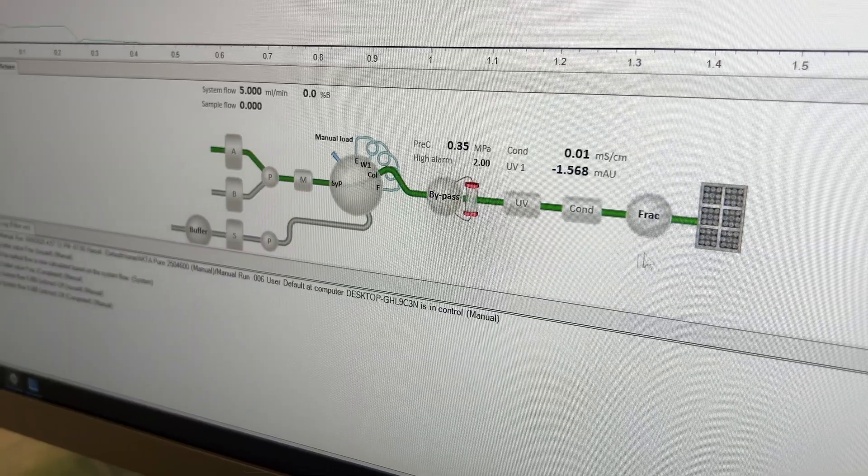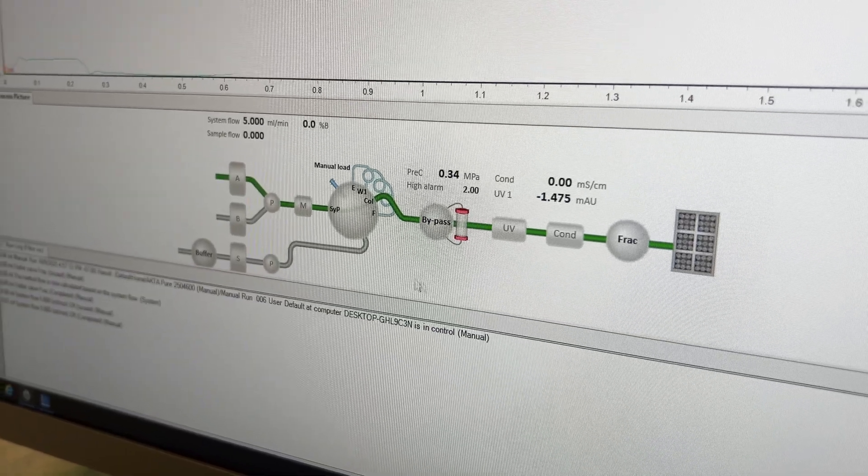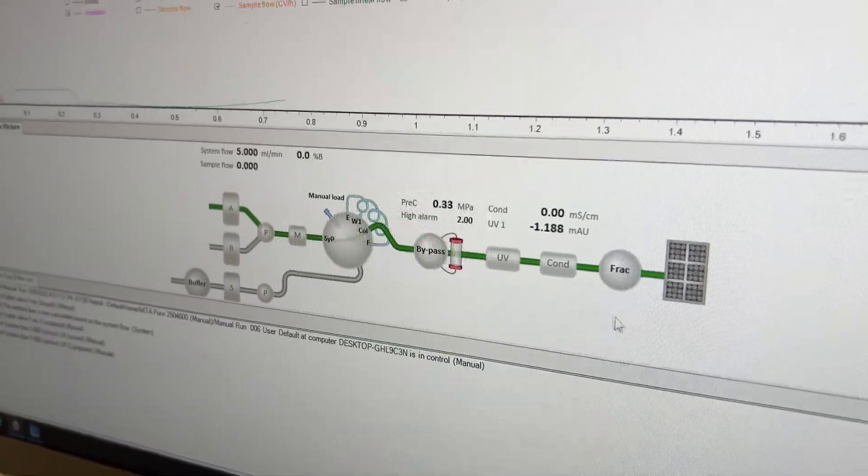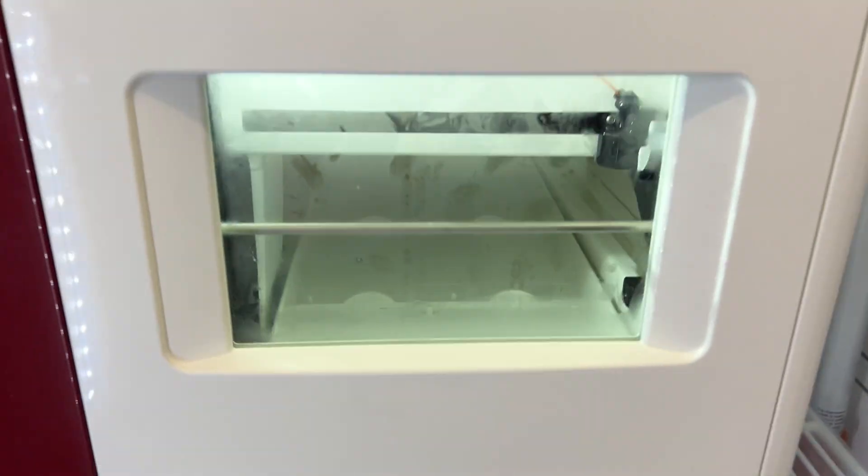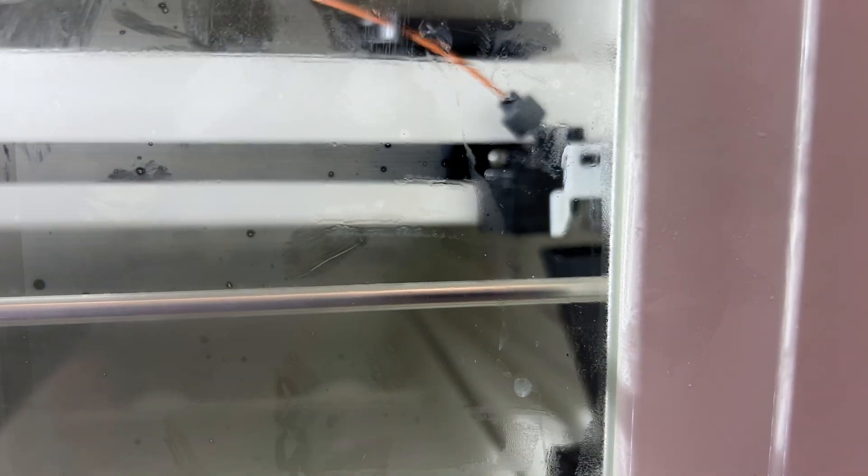And so we can see it's not going through the column, which is good because we're going at a really high speed, but we're just flushing out the water. So if we come over here, we can see that liquid is coming out through that fraction collector and it's going into the waste.